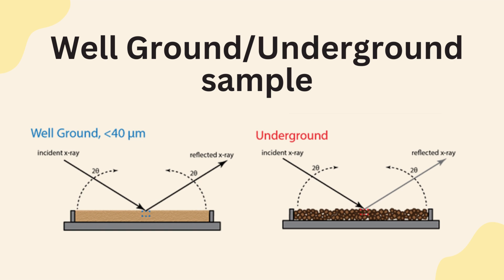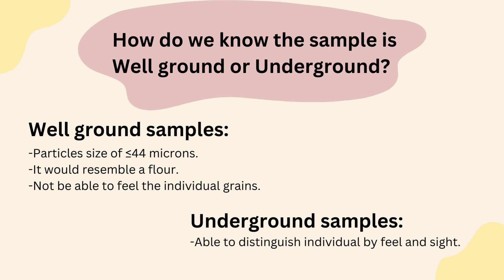This is an example of a well ground and underground sample. How do we know the samples are well ground or underground? For well ground samples, it has a particle size of at most 44 microns. Besides, it would resemble a flour such that when we rub the sample between fingers, we would not be able to feel the individual grains. On the other hand, for underground samples, we would be able to distinguish individual grains not only by feel but by sight as well.